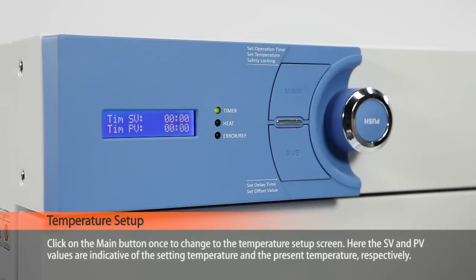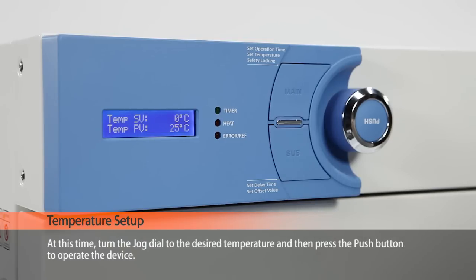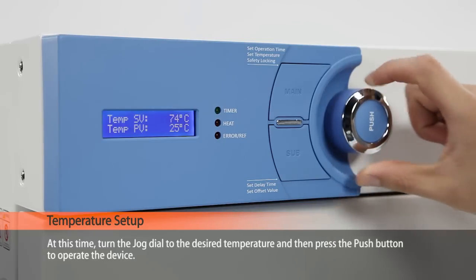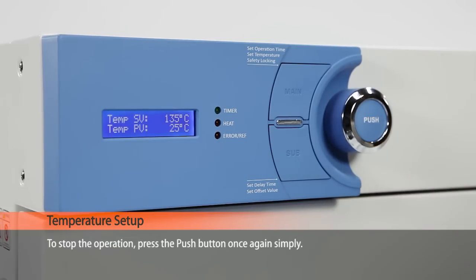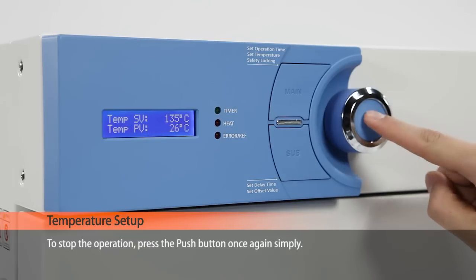Click on the main button once to change to the temperature setup screen. Here, the SV and PV values are indicative of the setting temperature and the present temperature respectively. At this time, turn the jog dial to the desired temperature and then press the button to operate the device. To stop the operation, press the push button once again.